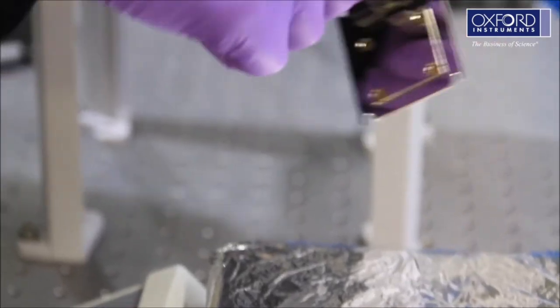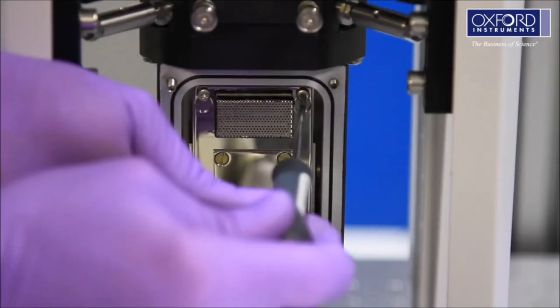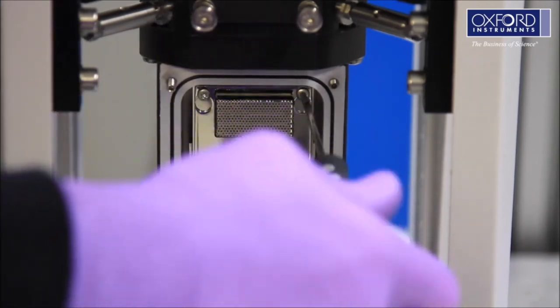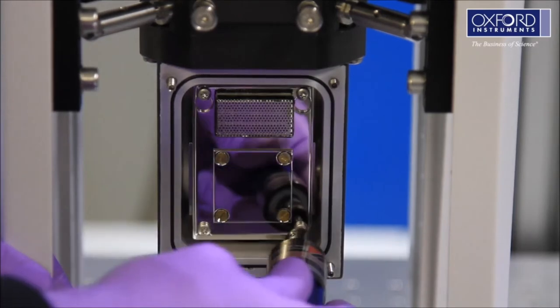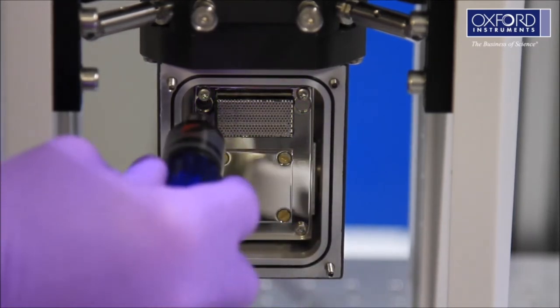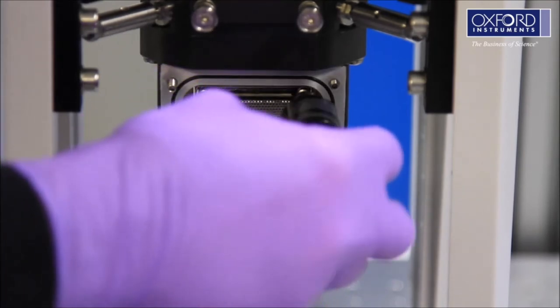Refit the radiation shield plate to the cryostat. Please note, this will now be hot so you must take care not to burn yourself. Tighten the bolts to the correct torque to ensure good thermal contact. Refer to the system manual for full details.